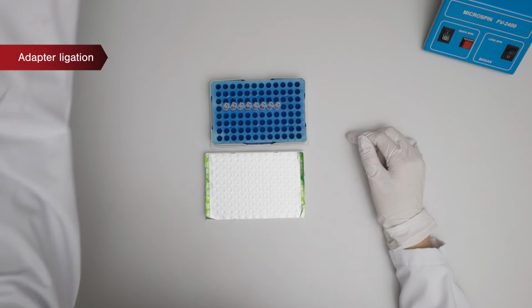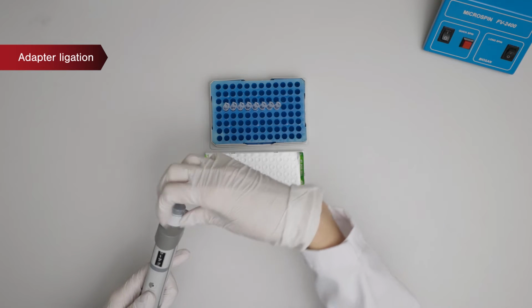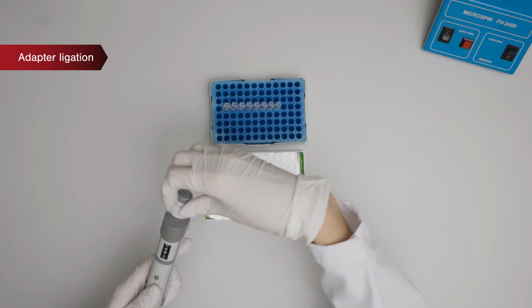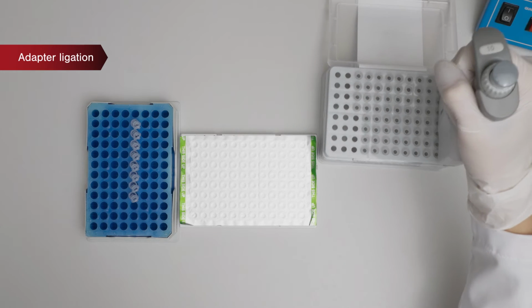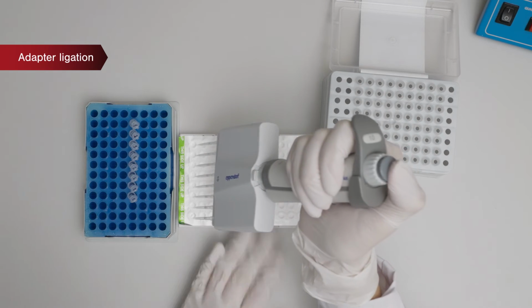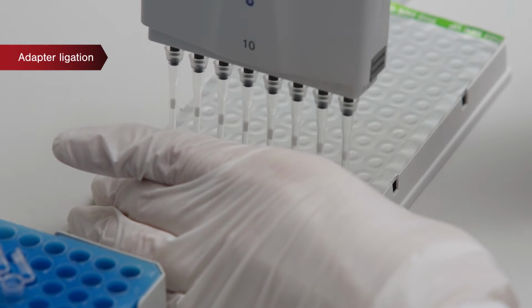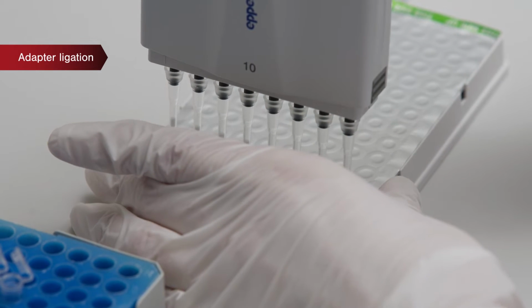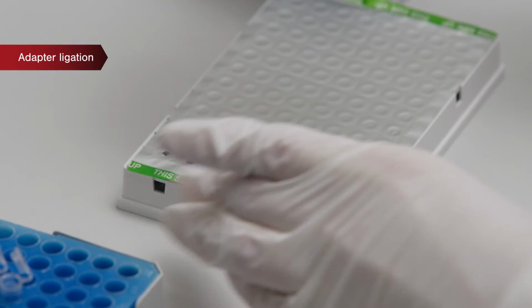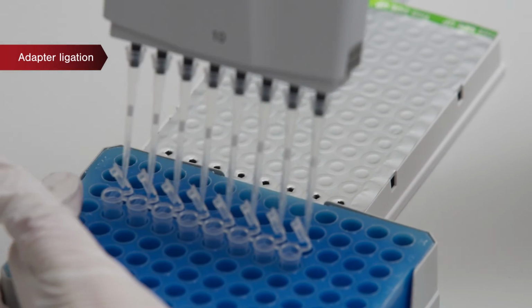Five microliters of the adapter have to be added to the 50 microliters of reaction mix from the previous step. If a smaller amount than 50 nanograms of sample was used in the beginning of the protocol, then adapters need to be diluted accordingly. For example, if 25 nanograms of the sample were used, then the adapter must be diluted 2 times.